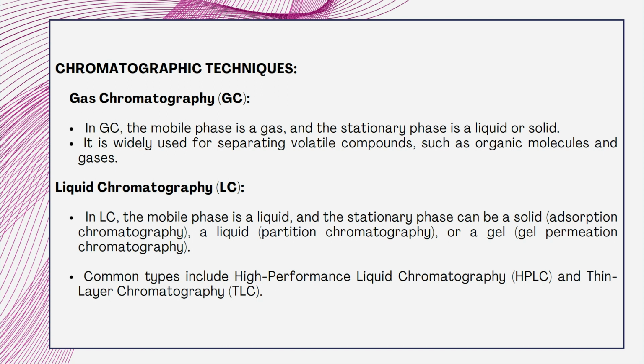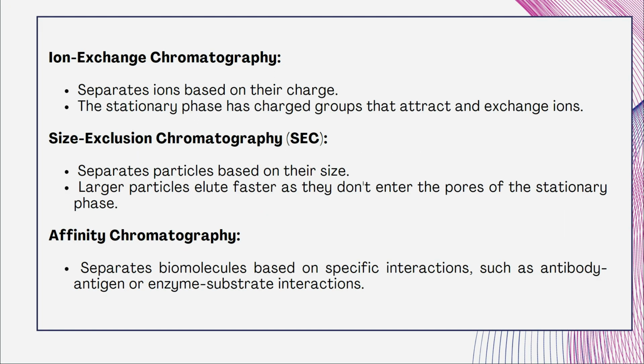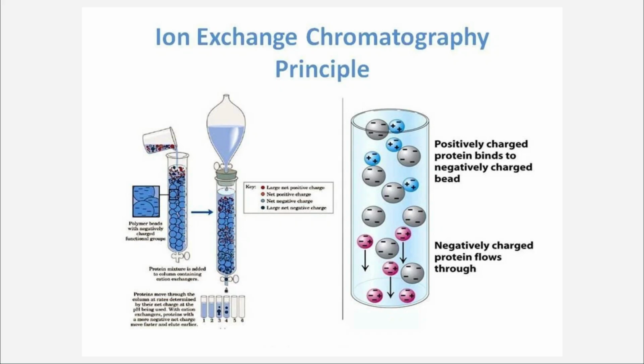Under this, you can see high performance liquid chromatography, which is nothing but HPLC, and thin layer chromatography. Apart from this, you also have ion exchange chromatography, size exclusion chromatography, and affinity based chromatography. Let us see them one by one.